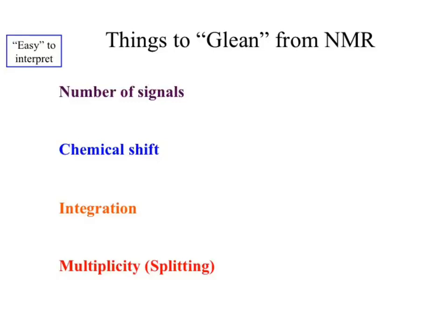So from our NMR, we ended here, but we'll kind of go through it. Again, I've been watching people go through and solve, and almost everybody jumps to the multiplicity or splitting to do some kind of understanding or interpretation of a spectra. It's not that that is per se wrong. That just happens to be the most difficult thing to analyze in HNMR. So if you jump to that point, you would better be confident in every other analysis.